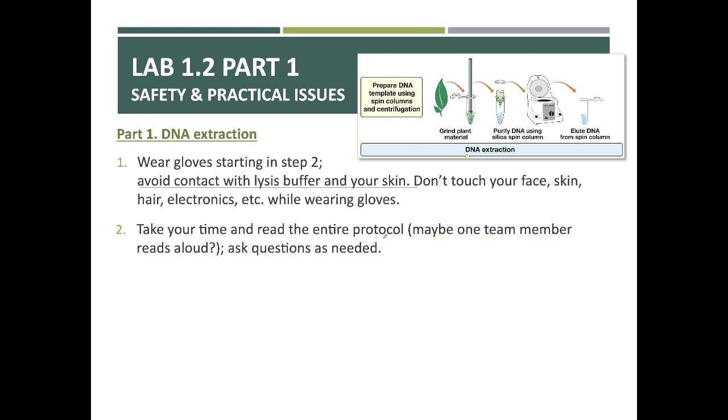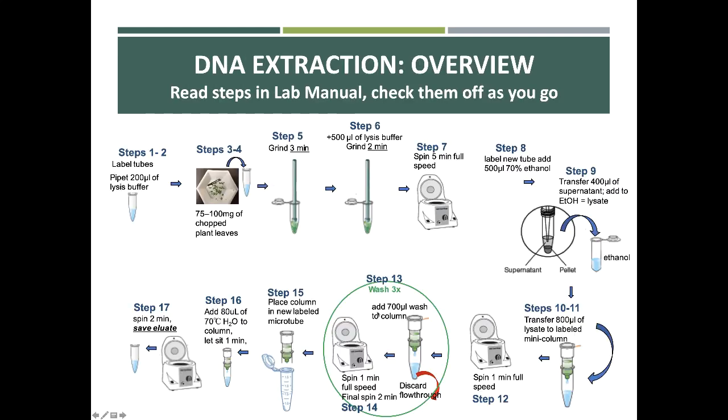Make sure you read the entire protocol. I know you're not doing this procedure specifically, but make sure you read the whole protocol. Associated with the DNA extraction is worksheet 1.2. It's due Thursday. Make sure you complete that. The steps, just to go through them real quick, so you understand why we're doing some of these steps. The protocol in your lab manual goes through it pretty well, so make sure you look at that in answering your questions. Just a few words of wisdom as we move through here.